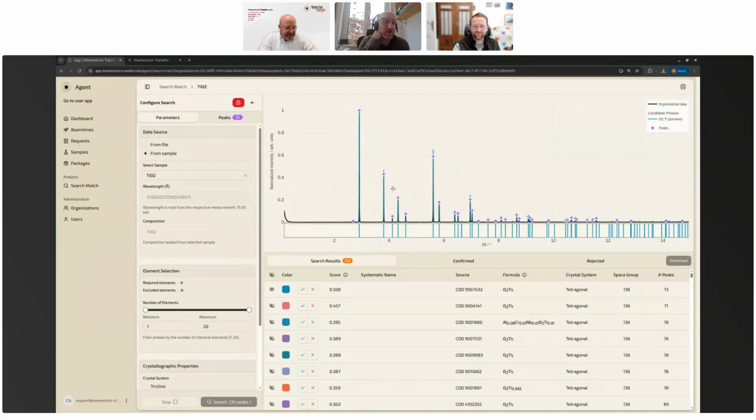And maybe, for newcomers in the call, I think that's something important for people to be aware of: if you measure diffraction data on different sources with different wavelengths, then the relevant angular range that you'll be looking at can be substantially different. This still happens a lot for new users with us, where they get these diffraction patterns over like 0 to 14 or 15 degrees.